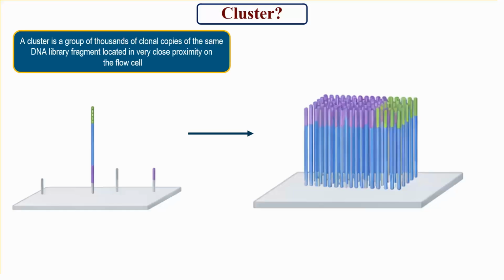During the sequencing run, all strands within each cluster are imaged in every cycle. Each bright spot represents a cluster producing signal. We will show it later. Dark regions indicate areas where no clusters are present. The instrument uses these images to determine cluster location and signal intensity, and to identify which base is incorporated at each cycle. Now we will discuss cluster generation in detail.